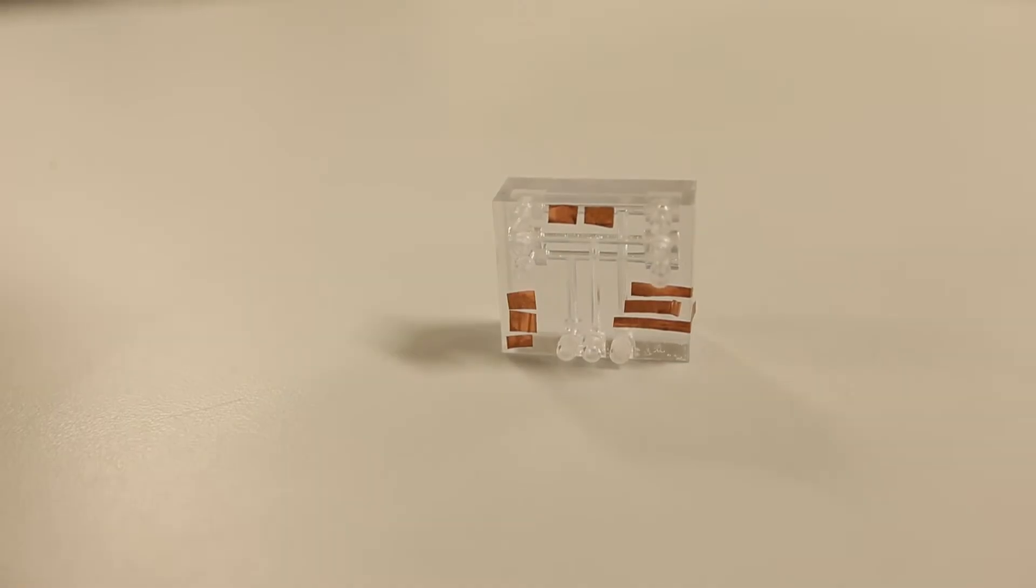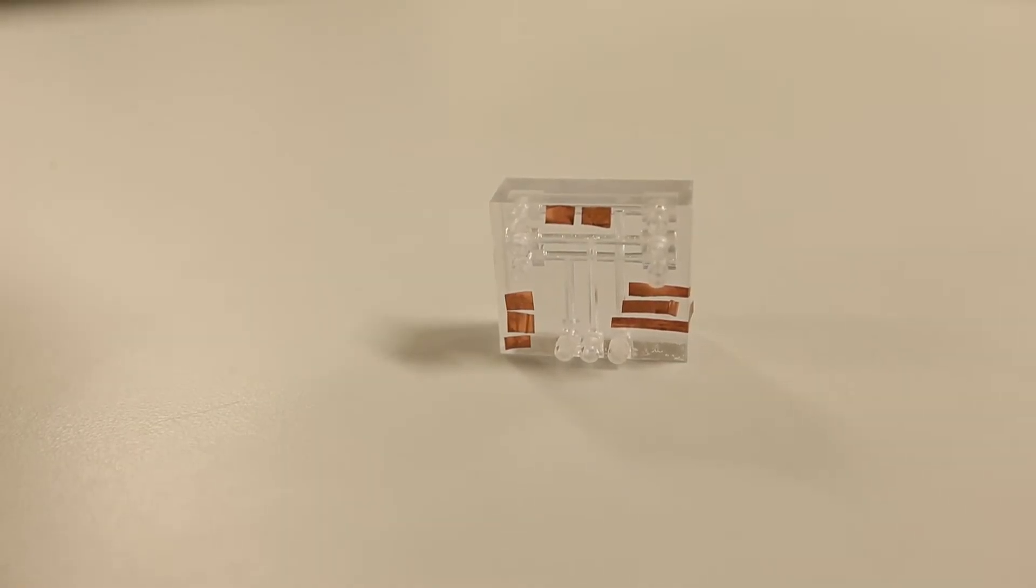That little box is a lab on a chip which takes the entire processes of a blood lab and shrinks it down to the size of your thumb. It can do multiple different processes in one test and can save space, time, and cost while being very efficient.